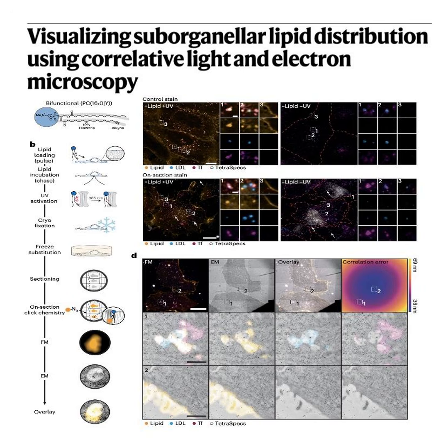Instead, they synthesized a lipid with two microscopic chemical modifications, a diazirine group and an alkyne group. Which are tiny. Incredibly tiny. When you look at the physical footprint of these two tweaks, the combined effect is basically equivalent to the lipid just having one extra double bond in its tail. Wow, so chemically, it's practically a native lipid. I think the authors actually call them innocent tracer molecules.